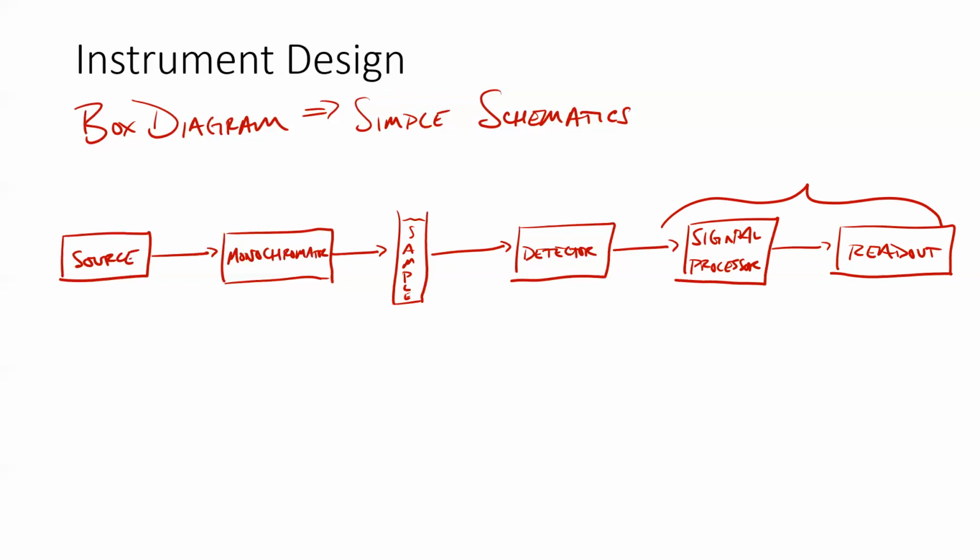And so this is the simple box diagram for UV Vis. We have some light source. We're going to get a single wavelength of light, or we know it's not really a single wavelength, but a bandwidth of wavelengths of light. We're going to pass that through our sample, and then we're going to detect that light somehow. We'll go through these 3 components and talk about how they're useful and what common types of each are. Then we'll come back together and talk about real life instrument design rather than just a box diagram.